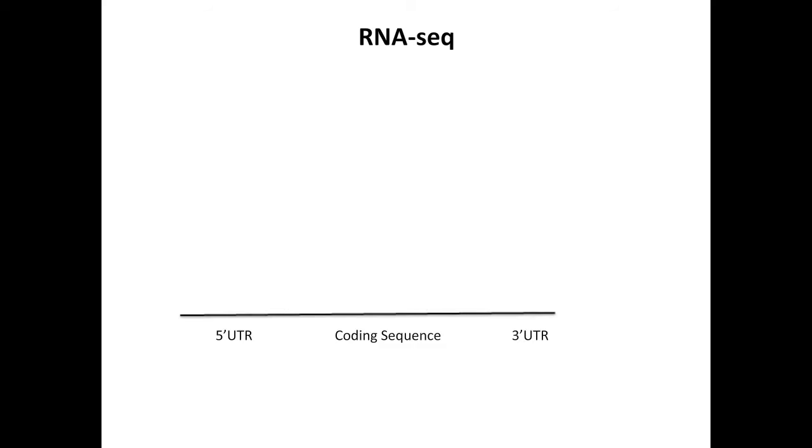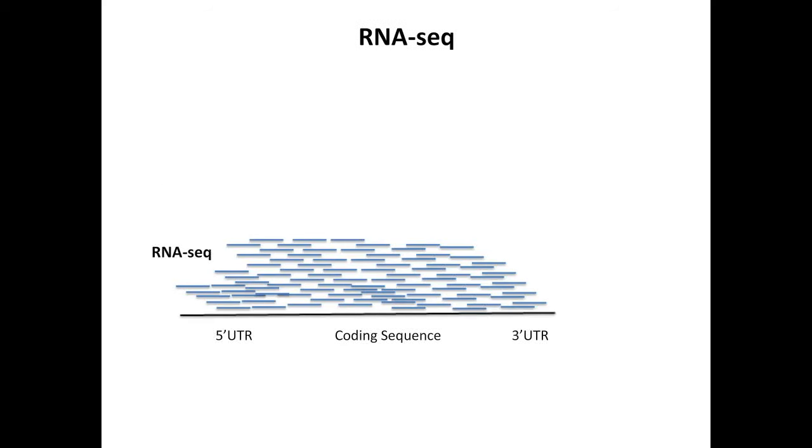But if you compare RNA-seq with 3' RNA-seq, here you can see that in 3' RNA-seq, we don't sequence the full transcript, but we focus on the right-hand side, the 3' UTR. We only sequence 100 base pair from the 3' UTR, and we use this information to quantify gene expression. So if we count all these transcripts one by one, we could quantify expression of the gene.